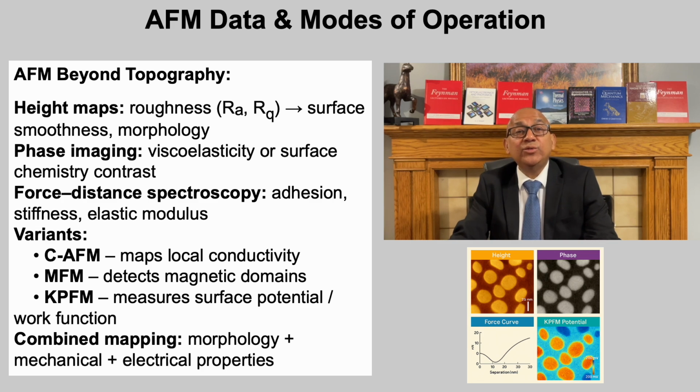Another capability is force distance spectroscopy, where cantilever deflection is plotted against tip sample separation. From these curves, we can extract adhesion forces, elastic modulus via the Hertz model, or even binding energies in biomolecular systems. Several AFM variants extend its functionality further.